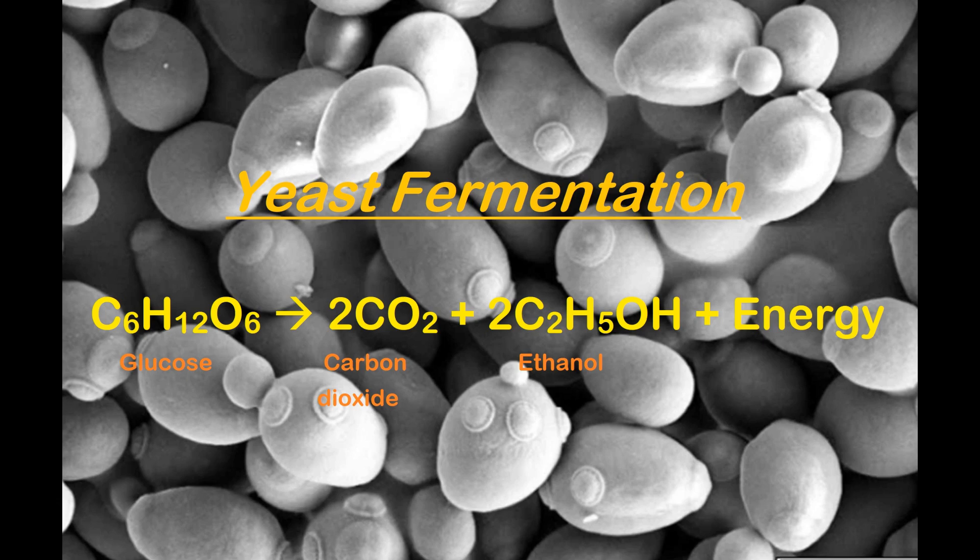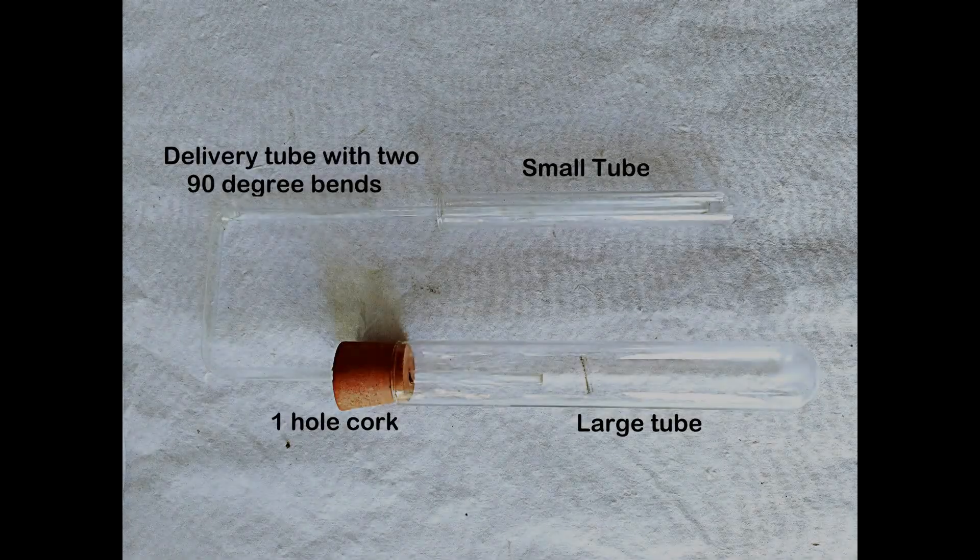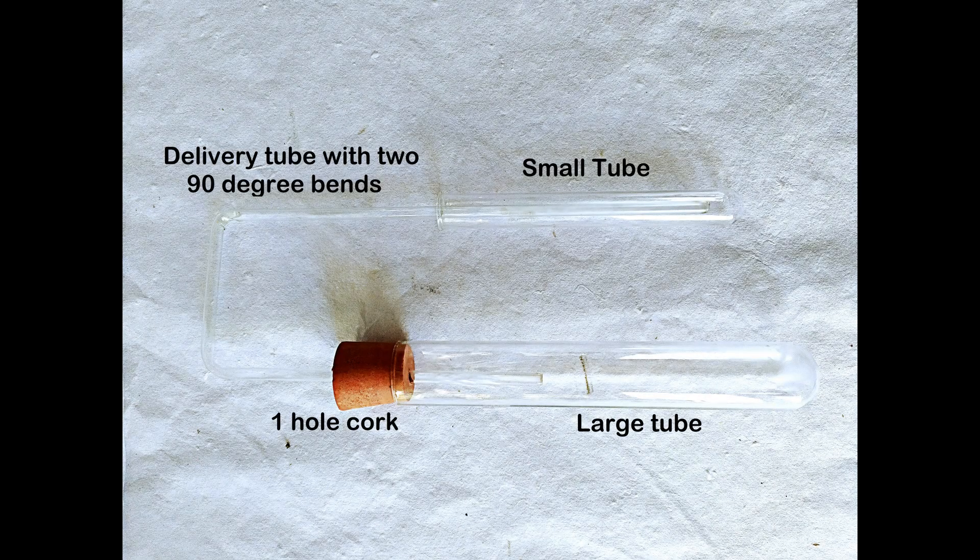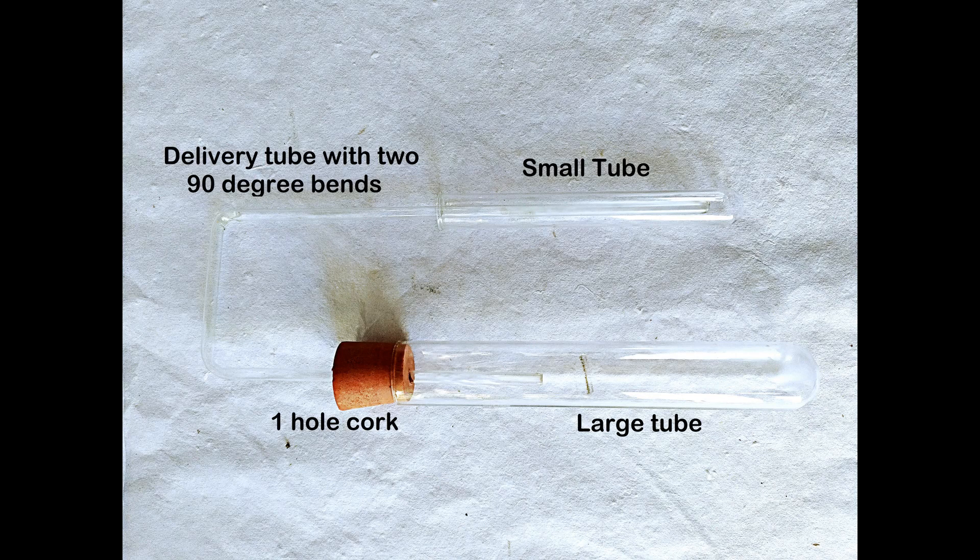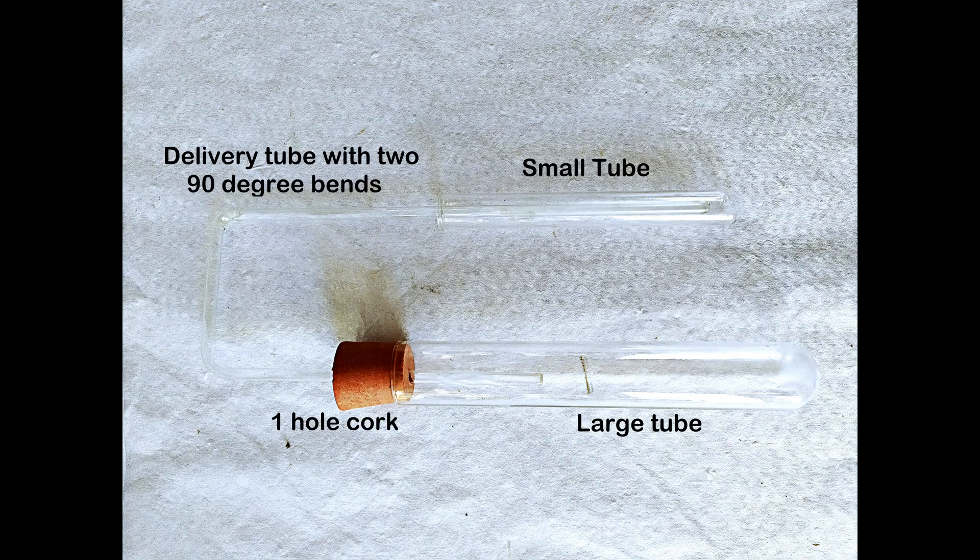For this experiment, we'll need a fermentation setup consisting of a large test tube with a tight-fitting one-hole rubber cork through which is inserted a delivery tube bent at 90 degrees in two places. One end of the delivery tube reaches a few centimeters into the large test tube while the other end reaches to the bottom of a smaller test tube.